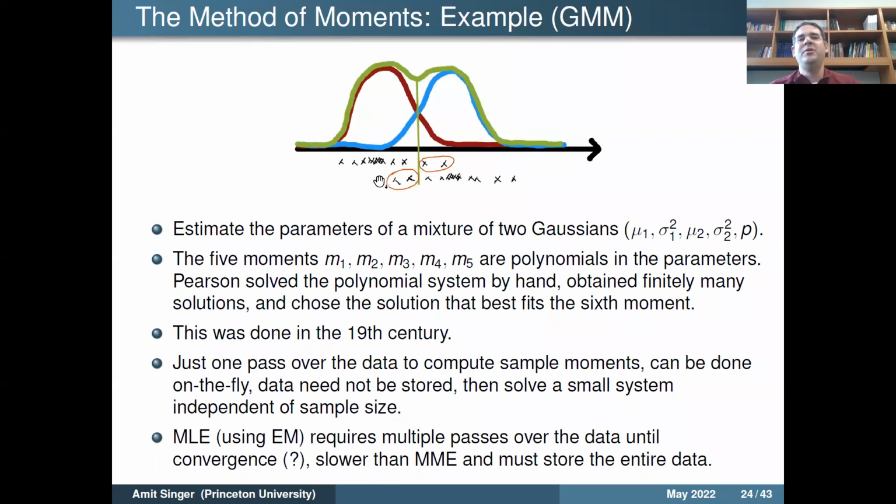If I just show you data, one way you can go about it is to try to cluster the data. I'll put my classifier here: everything to the left will be classified as red, everything to the right will be classified as blue. Then you see that you're going to make mistakes in the classification. The points that actually came from red are classified as blue and vice versa.